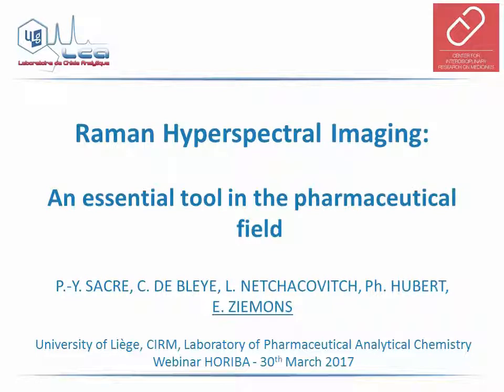First of all, I would like to thank HORIBA Scientific for the opportunity to present a part of my research activities conducted in the Laboratory of Pharmaceutical and Analytical Chemistry of the University of Liège. The topic of this webinar will be focused on imaging and more especially on Raman hyperspectral imaging. In the next half hour, I will demonstrate through case studies that Raman imaging can be considered as an essential tool in the pharmaceutical and in the biomedical field.